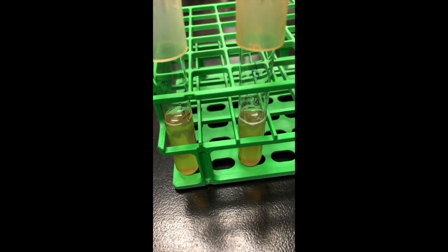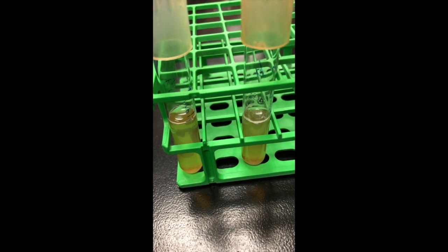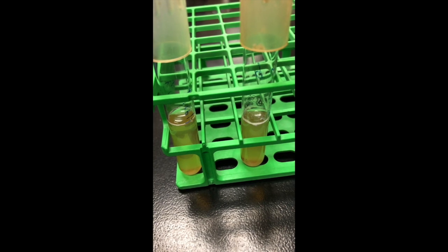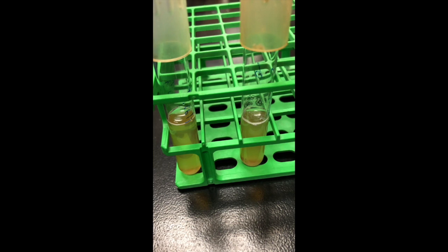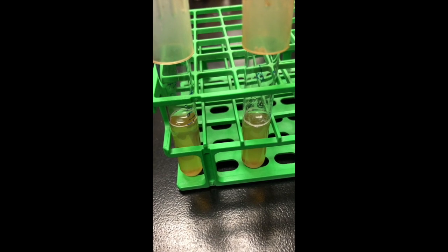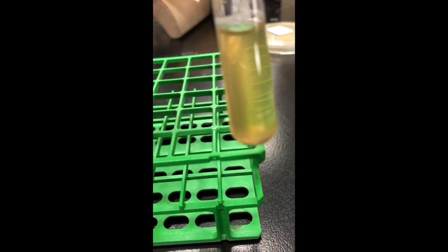So we're back to our nitrate test. And if you notice, both E. coli and Enterobacter stayed clear. This means that nitrate was reduced to something beyond nitrite. So the zinc wasn't able to find any nitrate to reduce, so we didn't turn pink. Now over here's your unknown. What do you think?